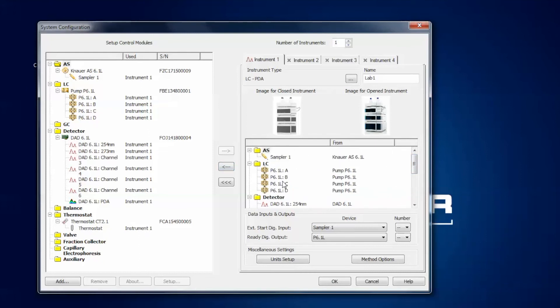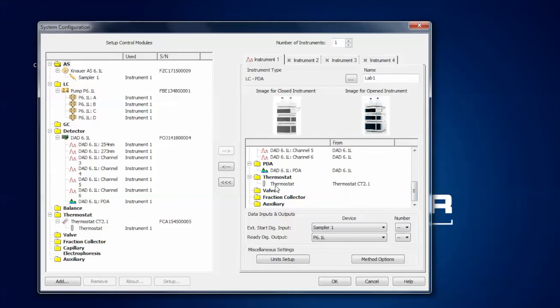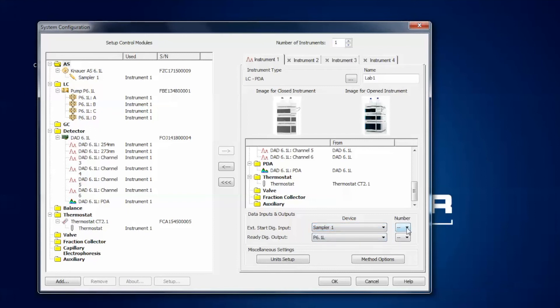The instrument now has an auto sampler, a pump, a detector with six channels, a thermostat, and the PDA option for the DAD. What remains is the external start digital input option, which means the software needs a signal from one of the devices indicating that the injection was performed so it knows when to start data acquisition. I select the auto sampler as the device that will send this signal, and select pin number one. There is also a ready digital output option where you select the device and pin through which the software informs other parts of the system that a sequence can be run — in my case I will not select this option.